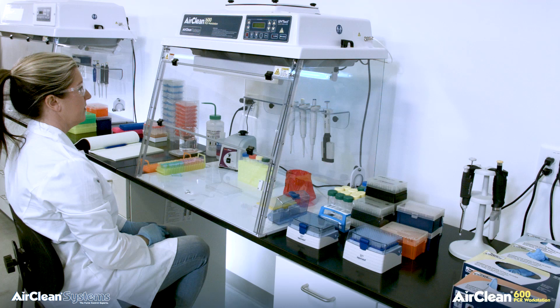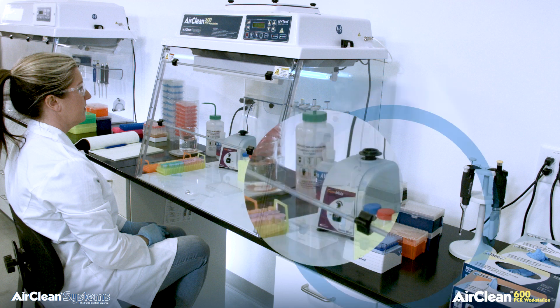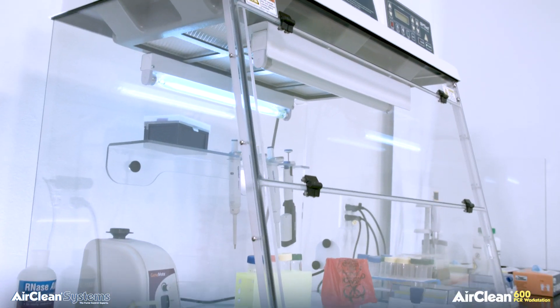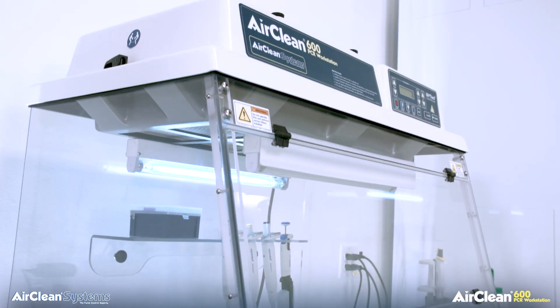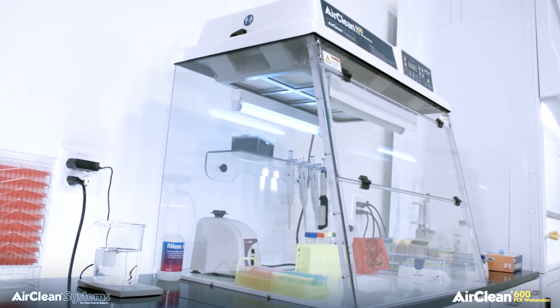The Combination PCR workstations are accessed through the front sash. A designed overlap in the front sash prevents UV energy from escaping the chamber during irradiation. AirClean Systems Combination PCR workstations are manufactured to ensure the operator is never exposed to harmful UV energy.